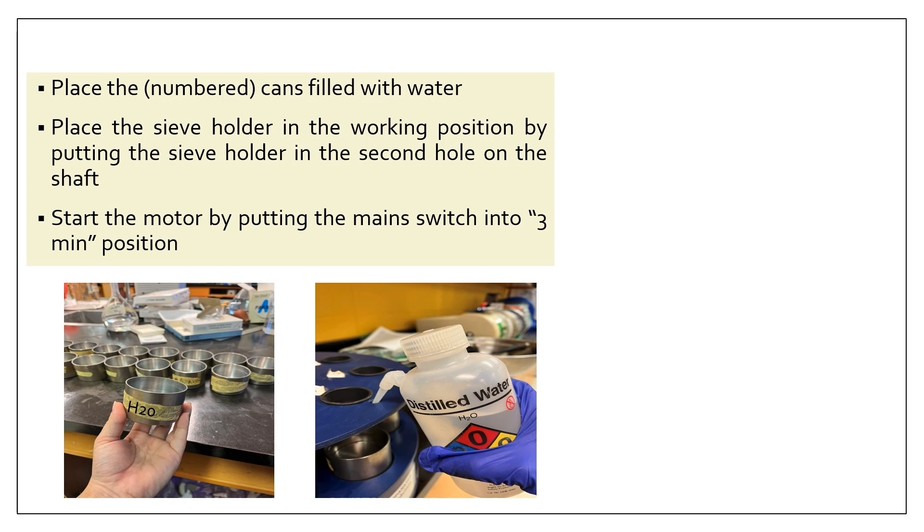Be sure to put enough distilled water into the cans so that soil in the sieves could get immersed in the water. We can also pour water into cans through the special can fill openings in the sieve holder.